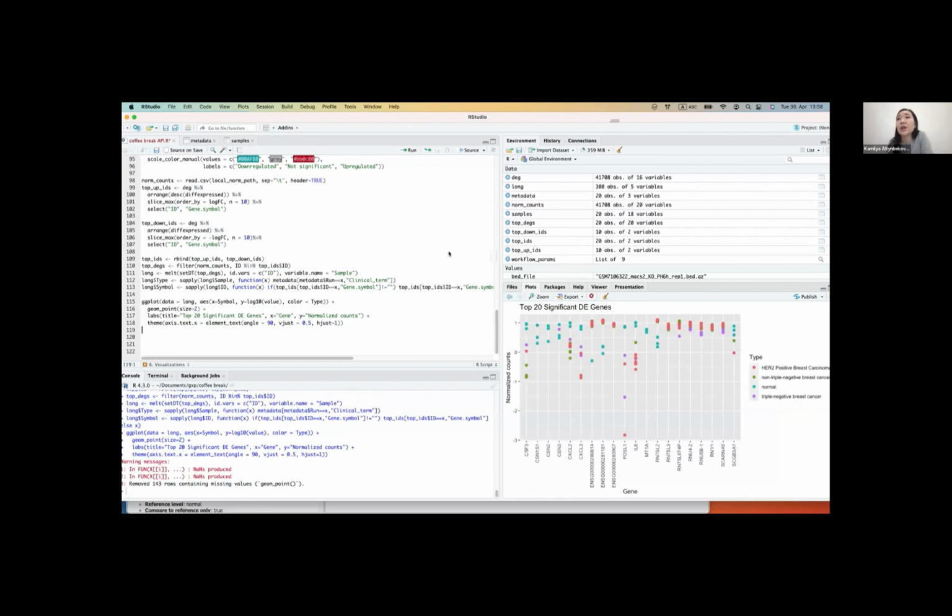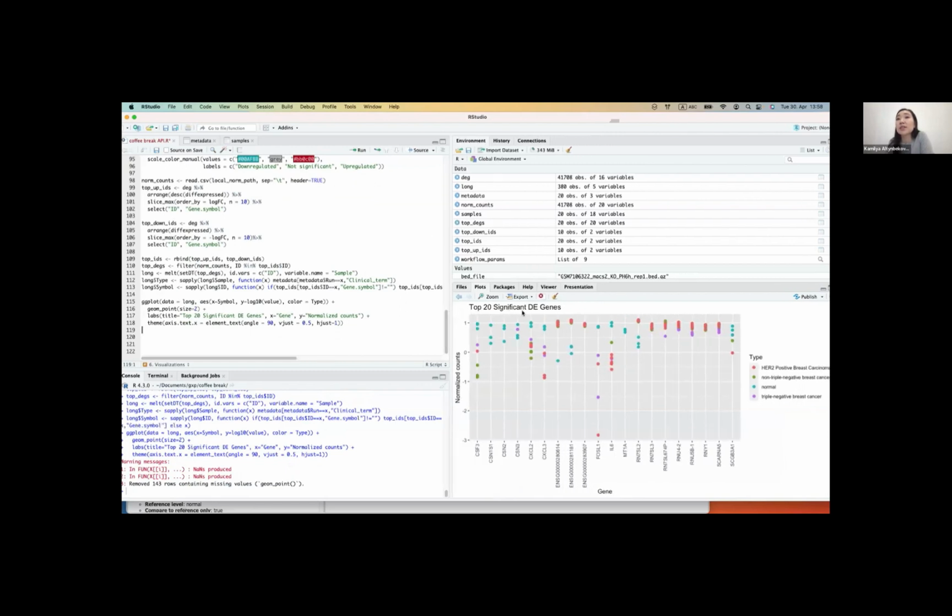So this is the top significantly differentially expressed genes with the names here. That's why I annotated the genes before, to have nice gene symbols here where possible. And here are the normalized counts, just to see how some very important genes found in the experiment behave differently in the samples, normal and cancer. Because we had different clinical information, we also visualize it nicely here in R.